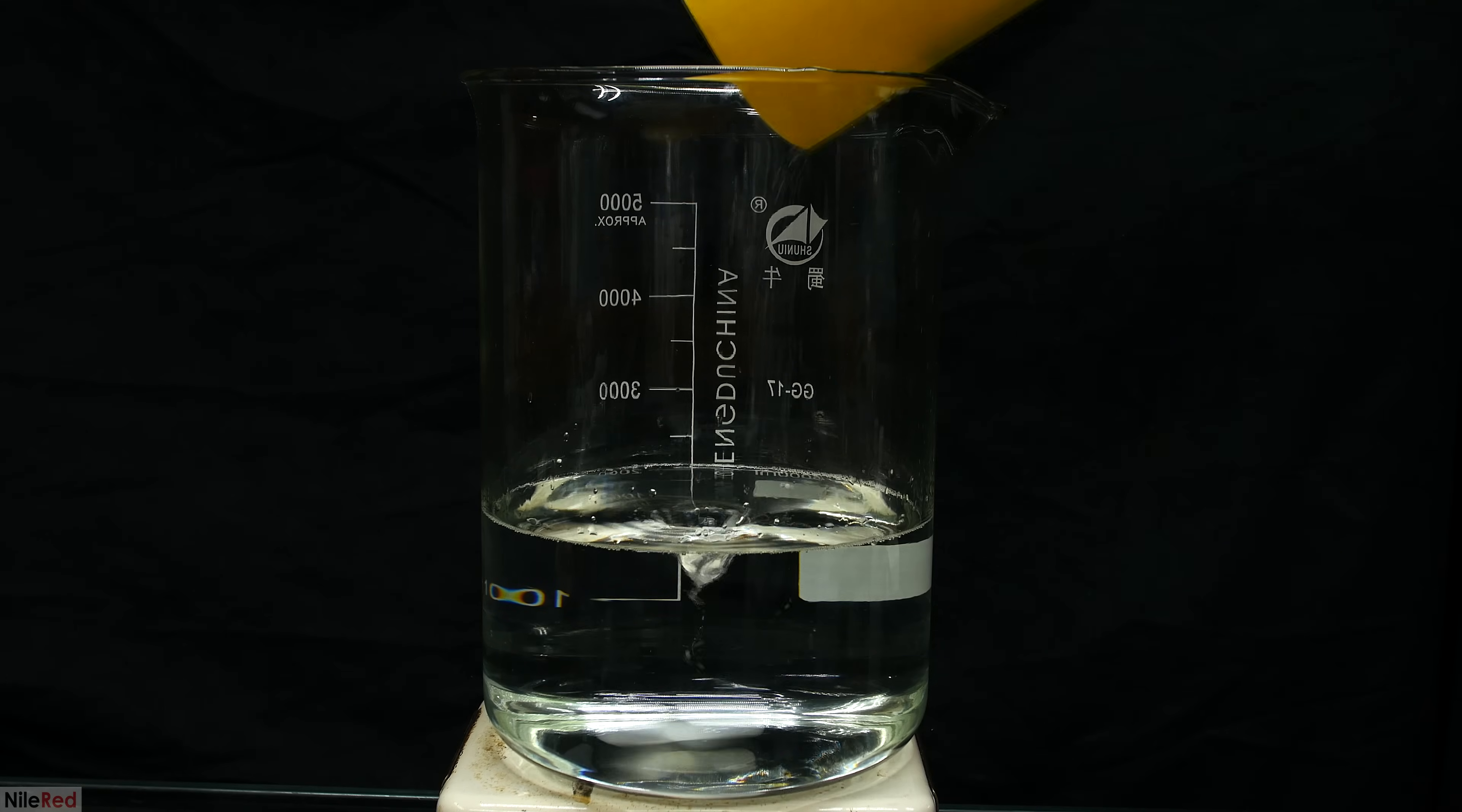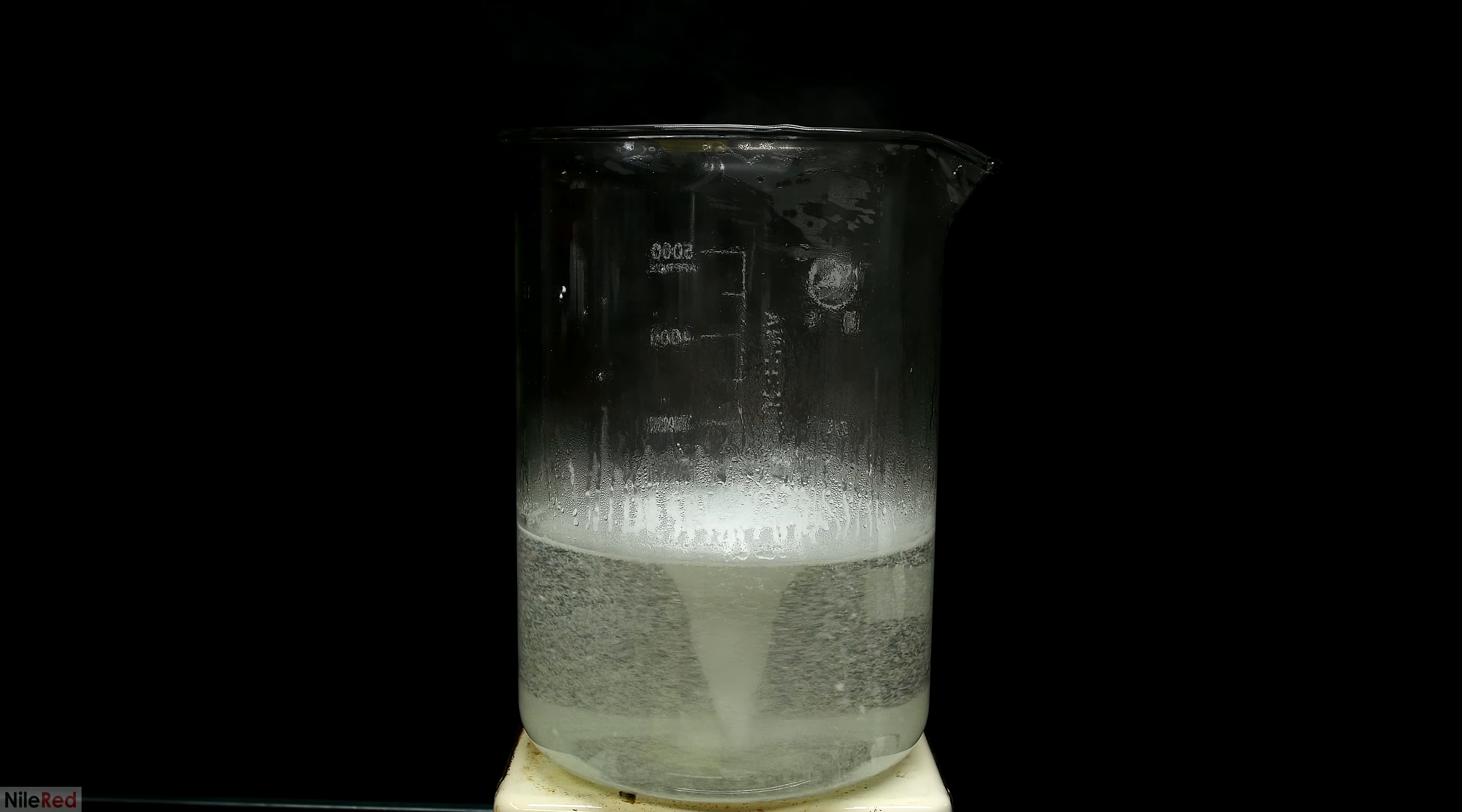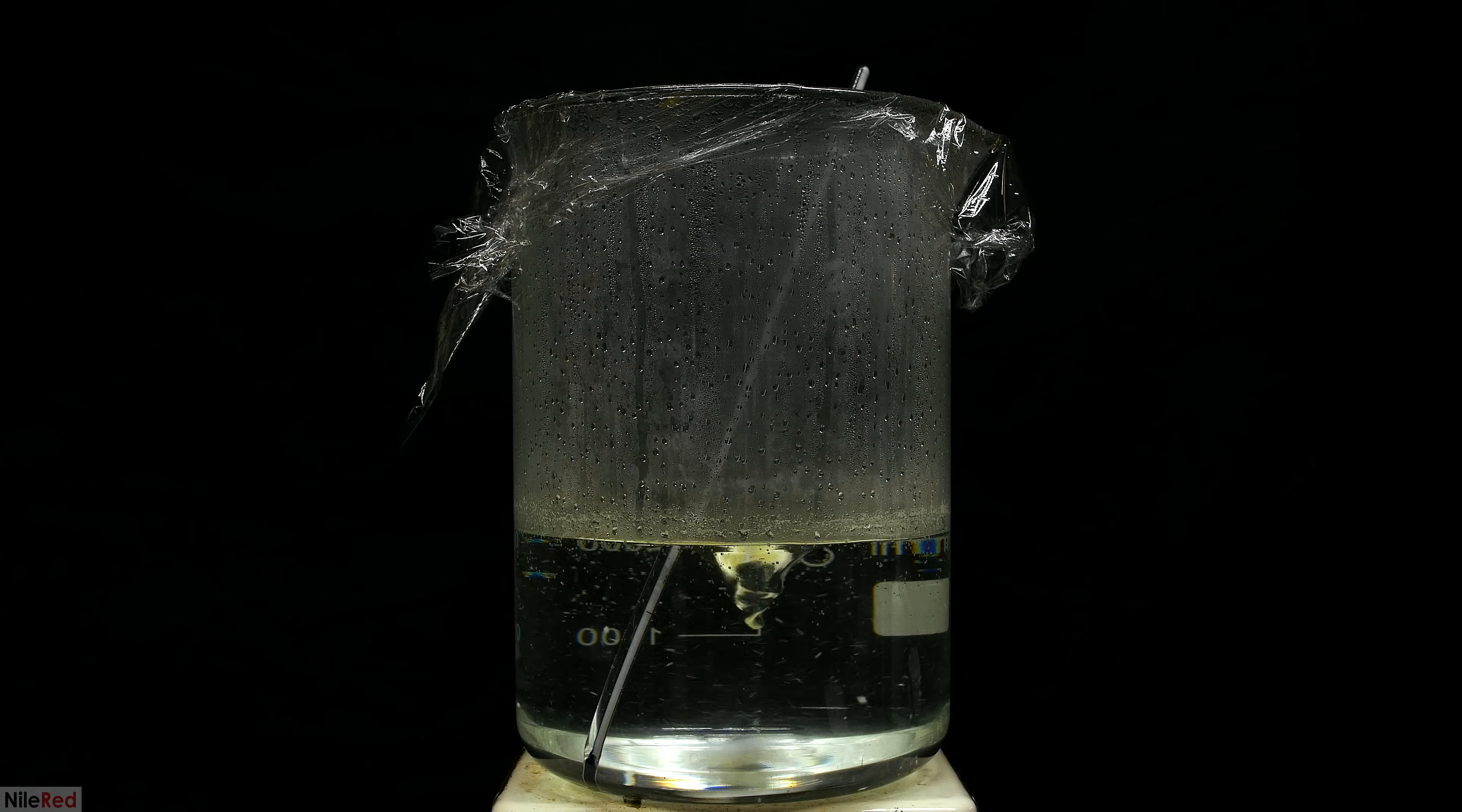I went ahead and dumped all of the trans-cinnamic acid into about 2 liters of distilled water. As the solution heats up and gets closer and closer to boiling, the trans-cinnamic acid slowly dissolves. Just to get an idea of how close I was to the boiling point, I added in a thermometer. I was also losing a lot of heat and water due to the steam escaping out the top, so I just covered things up with some saran wrap.